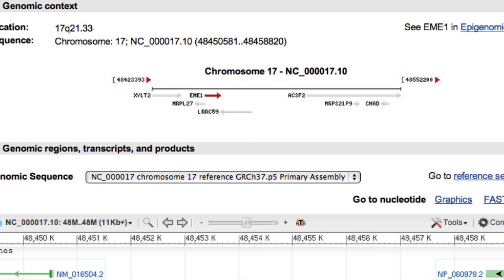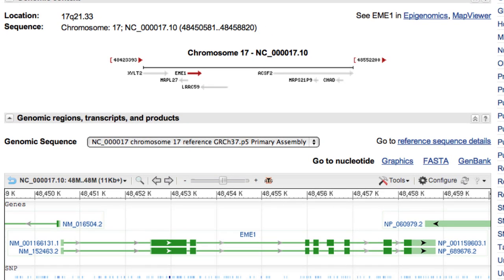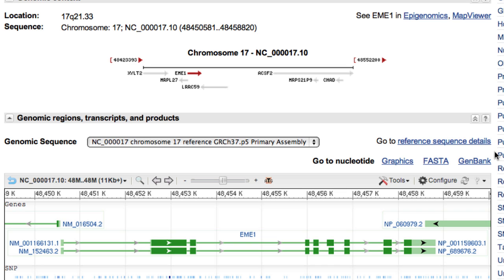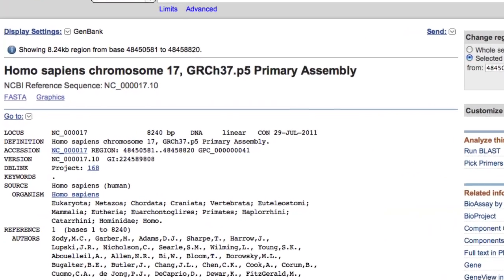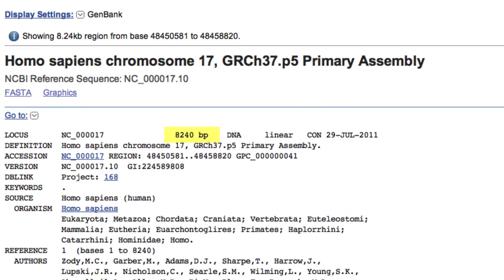A good way to get the genomic sequence is in the next section, where you can link to either the FASTA or GenBank format. I'll go to the GenBank view. This region includes 8,240 base pairs.